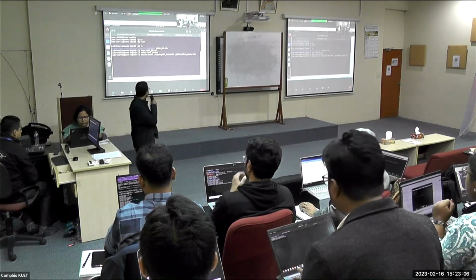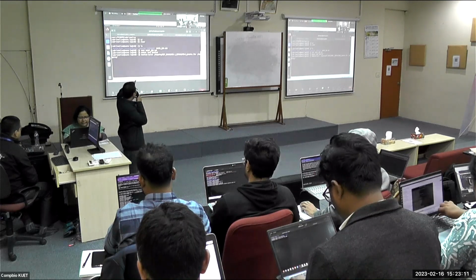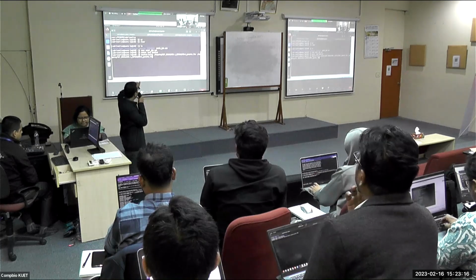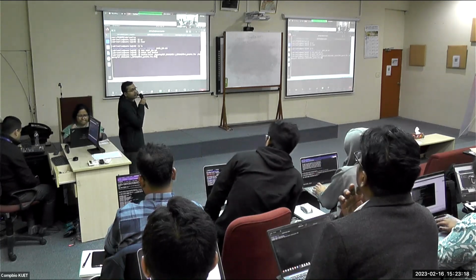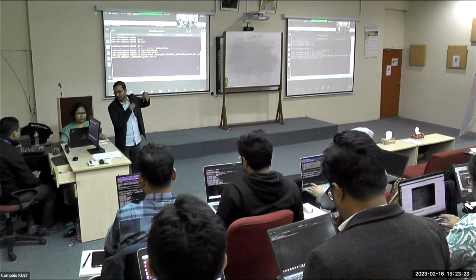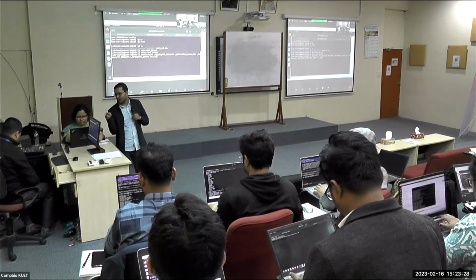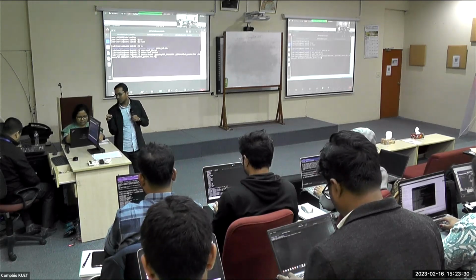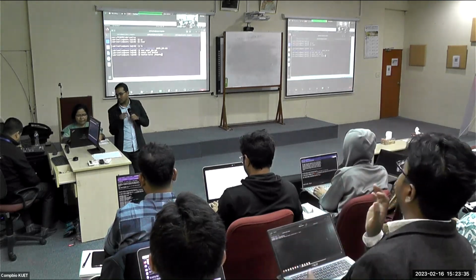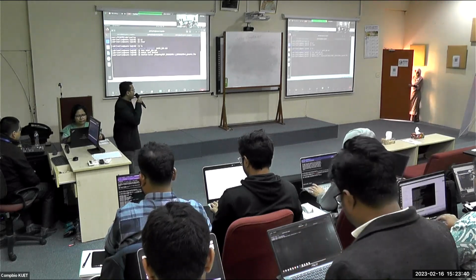Let me explain that. If you type bowtie2-build and then dot slash mapping and type G and press tab. After mapping, just type G, then the tab. Write G and tab.